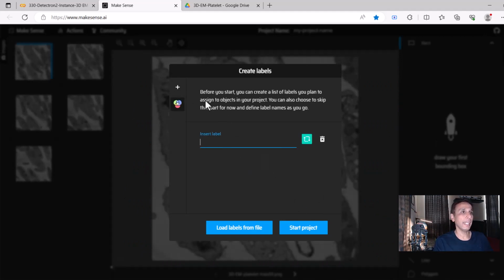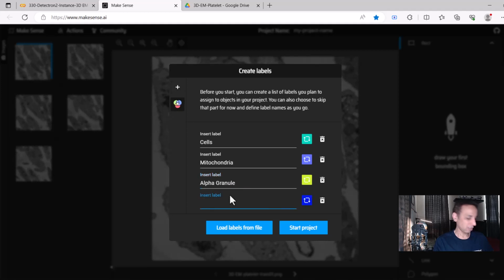Now let's go ahead and define our classes. What did I call them? Cells. And another one is mitochondria. And another one is, I think, alpha granule. Yeah. And the next one is canalicular vessel. Okay. Let's not worry if the spellings are right or wrong.